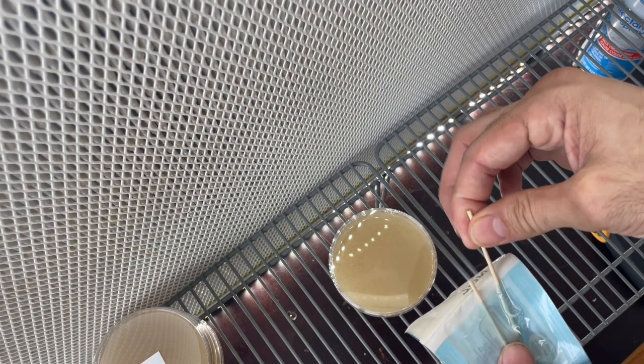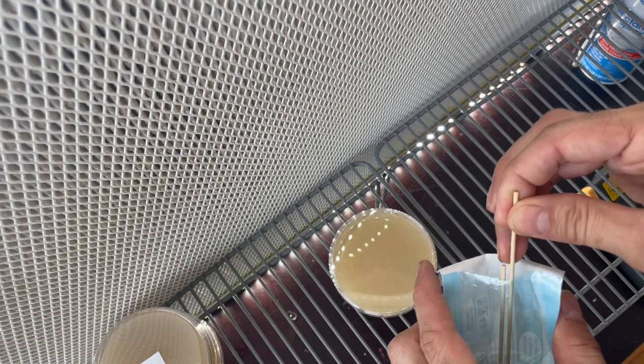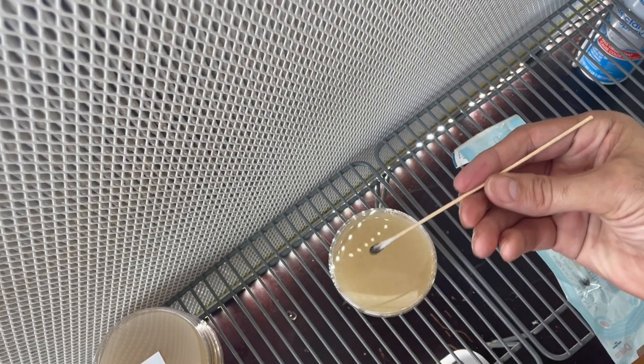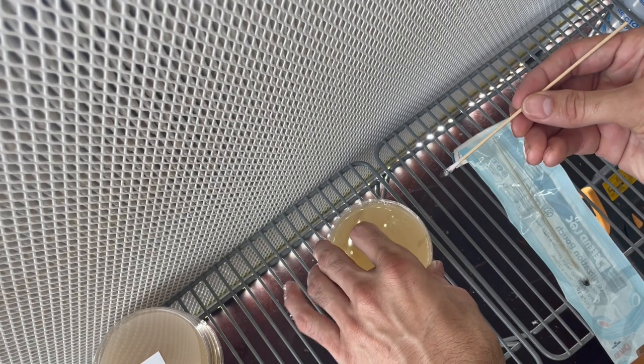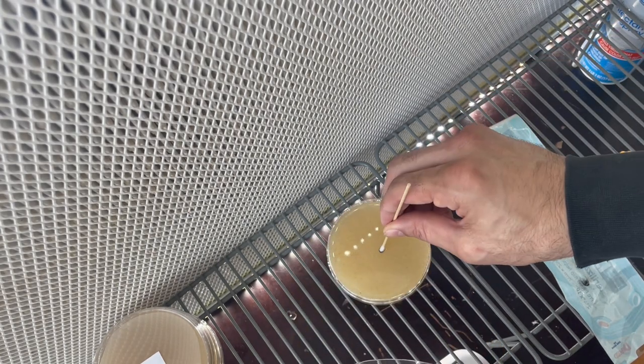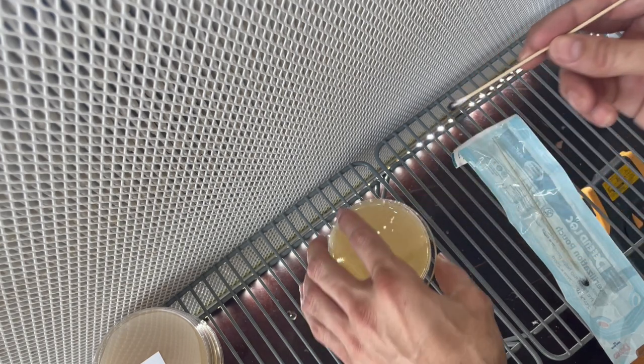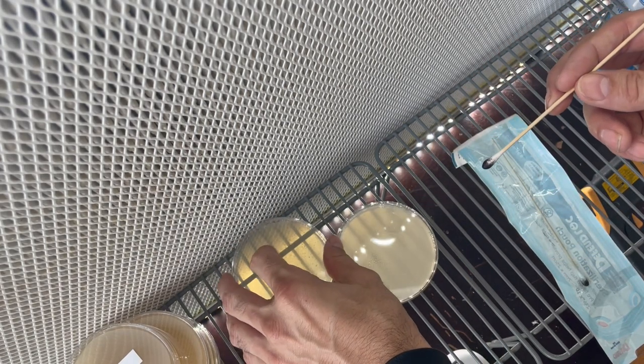We're going to slide this out carefully. From here we're going to take the swab and just do a little bit of a generous kind of twist. A little push in there. It's okay if you kind of dent the agar — it's not going to hurt anything.